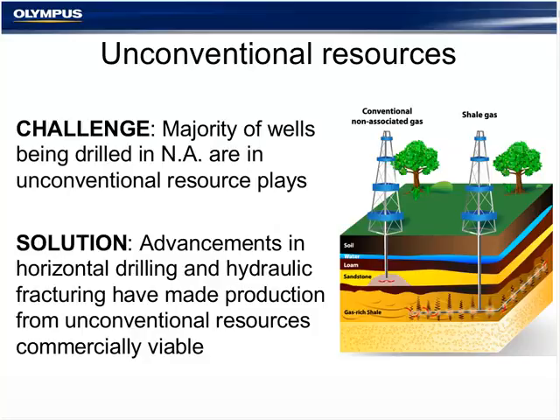XRD and XRF are cost-effective, powerful methods for exploiting rich but, I feel, very underappreciated sources of data: the well cuttings. And a quick primer for anyone who's not familiar, well cuttings, also known as drill cuttings, are the broken bits of rock and formation removed from a drilled borehole. These cuttings will vary in size and texture. They'll range from a fine sand to a gravel, depending on the type of rock being drilled and also the type of drill being used.